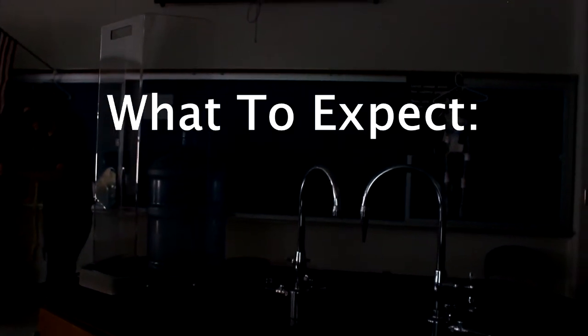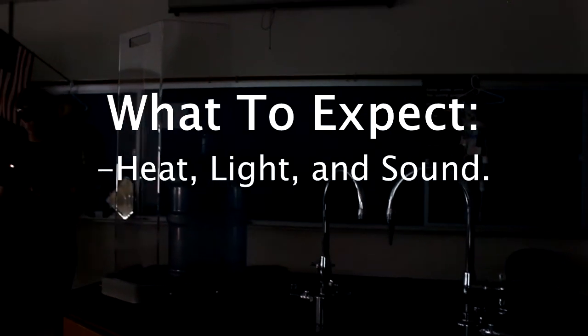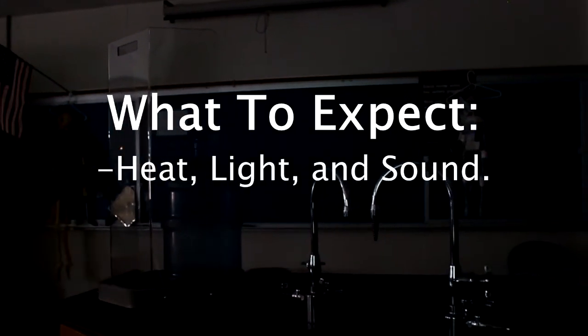What to expect? The vaporized isopropyl alcohol will ignite in a combustion reaction, producing a small amount of heat, a flash of flame, and a swooshing sound.